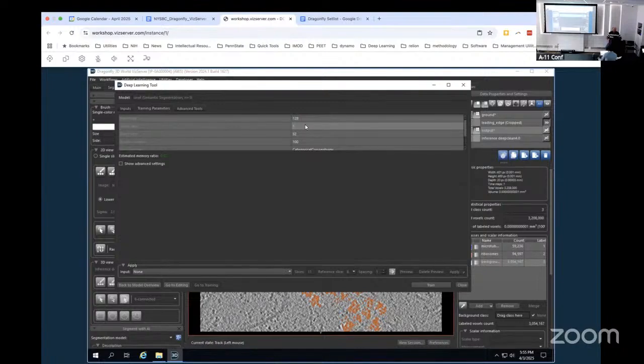Stride ratio is like, go ahead. Yep. You're going to scroll down on the window here. Or no, this one here, it's kind of hard to see. We need to scroll down below this part right here. I wonder why it's not.